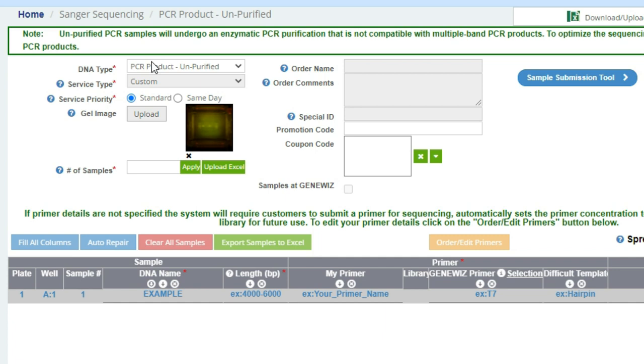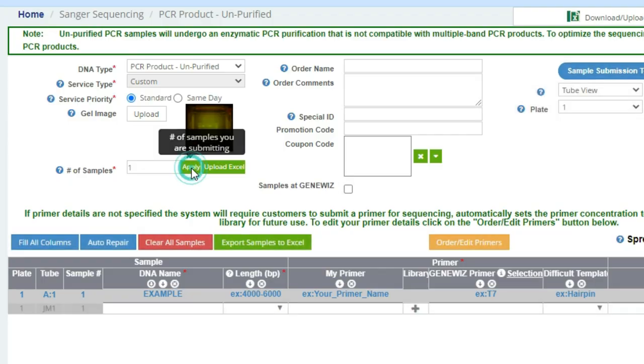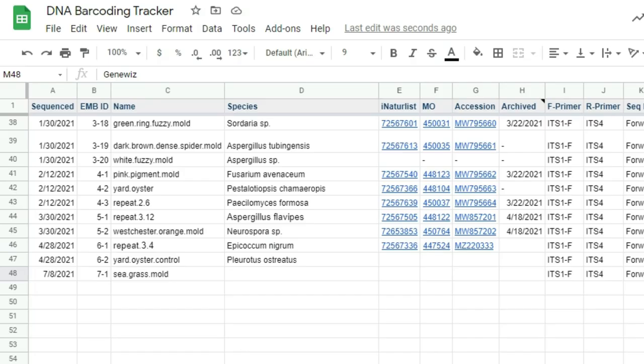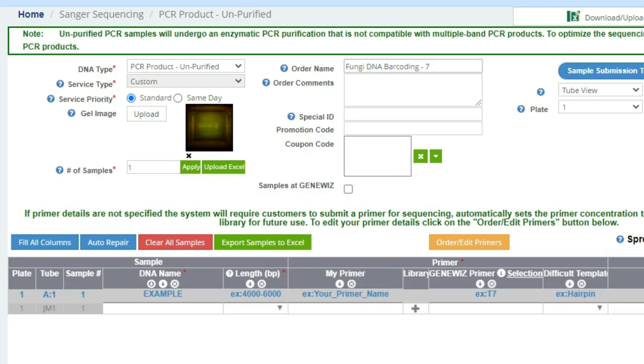Next, we'll need to enter in the number of samples that we will be ordering. So, just one for the seagrass. We'll enter in an order name. Now, I like to name these and have them correspond with my barcoding tracker, so here I'll name it FungiDNABarcoding-7 to indicate the seventh batch, and the seagrass will be the one and only sample.